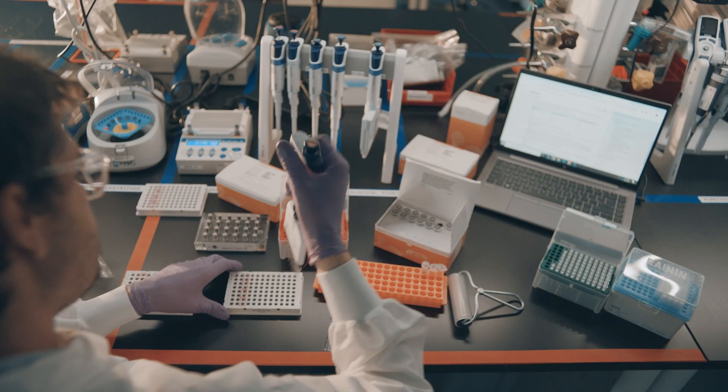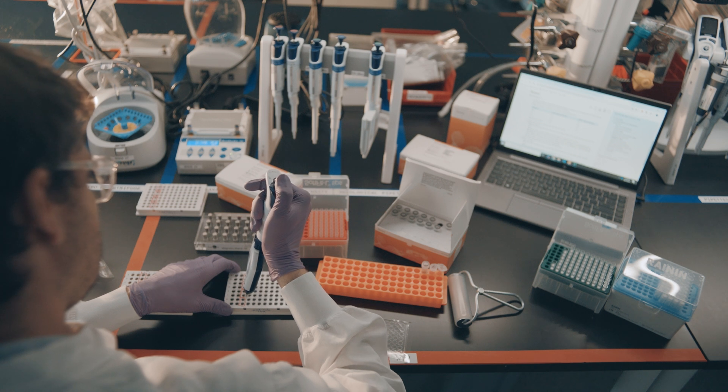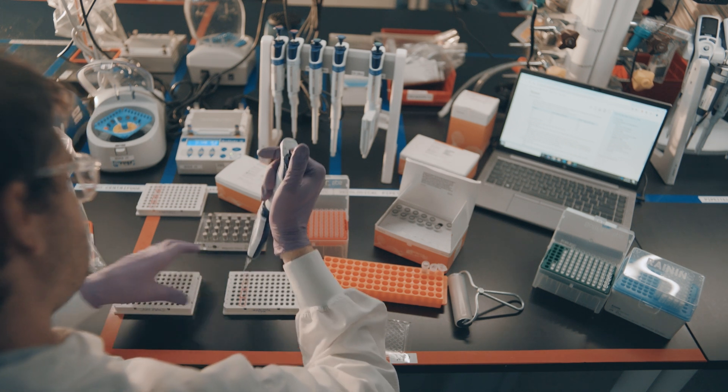For amplicon PCR for DNA targets only, users can start here to save time and hands-on steps.